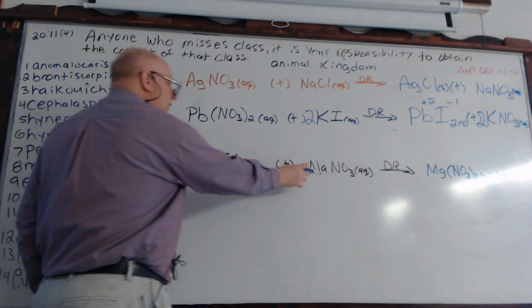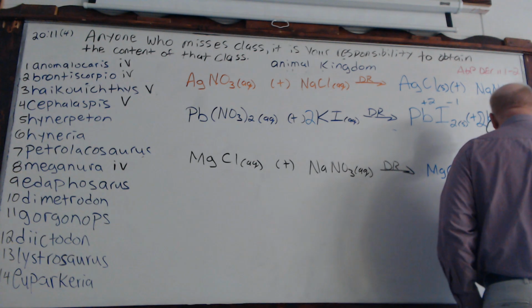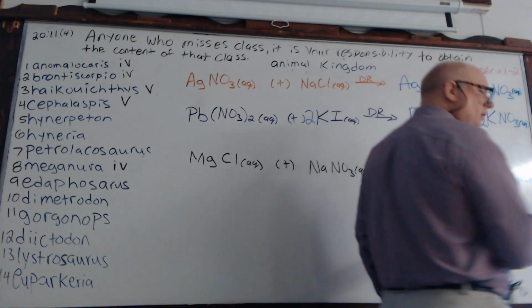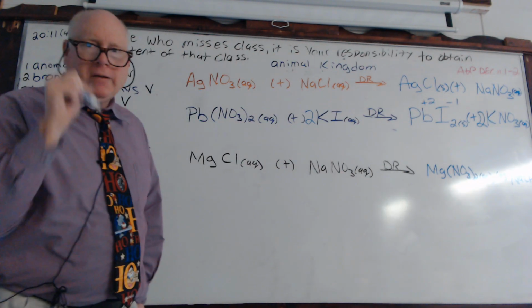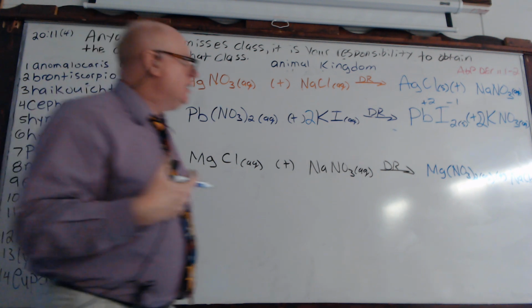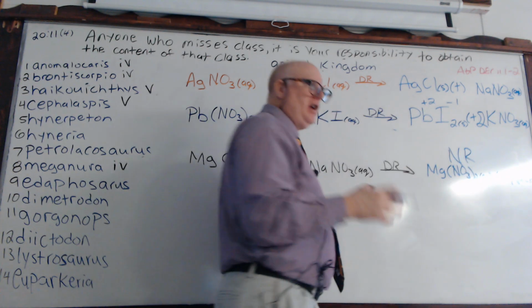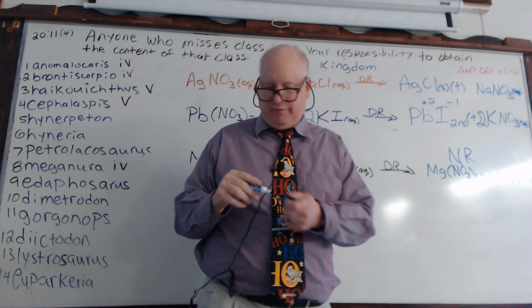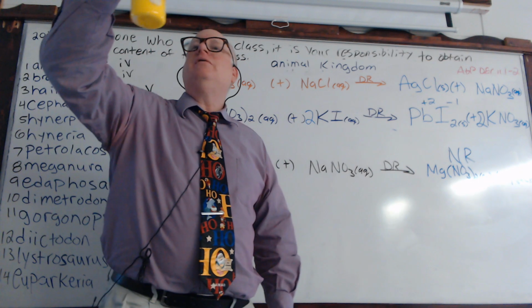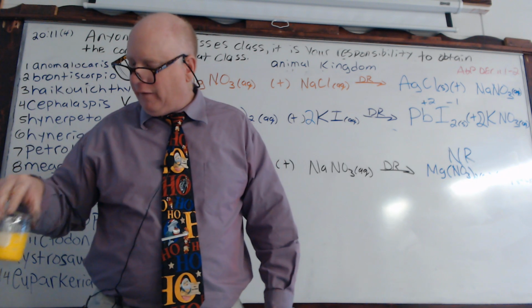What does sodium bond to? Okay, it's going to bond to the chloride. Is that soluble? Of course. And that's AQ for those of you tuning in a little later. Okay? Only for balancing purposes. Otherwise we would say no reaction because nothing's going to change here. It's all aqueous. All you have is just 2 liquids being mixed together. And that's it. Okay, you can kind of see that it's separating just a very fraction of a little bit.